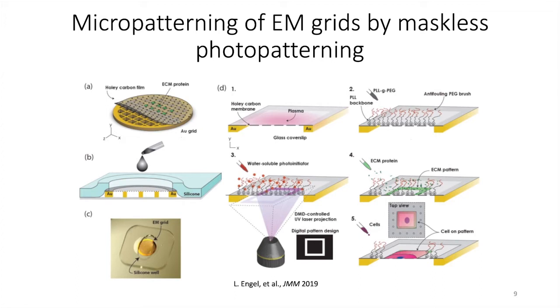We rinsed and added between 7 and 20 microliters of the PLPP photoinitiator to the grid. This is a pretty tricky step for beginners because it's very important not to let the surface dry out once the PLL-g-PEG has been applied. What I do is pre-fill one pipette with PLPP before pipetting off most but not all of the PBS from my sample using a different pipette in order to minimize the time that the surface isn't coated with liquid. Finally, we can load our glass bottom dish or glass slide containing the grid onto the stage of the microscope outfitted with PRIMO.